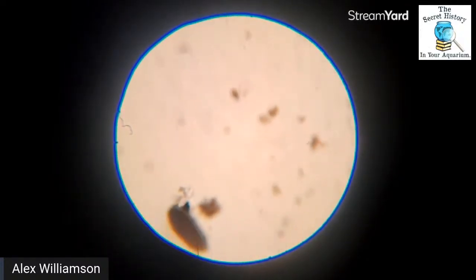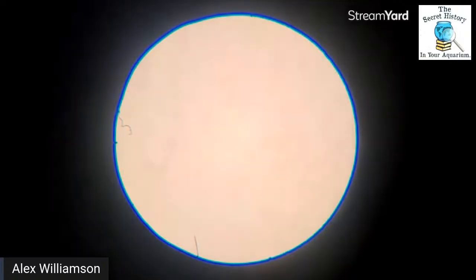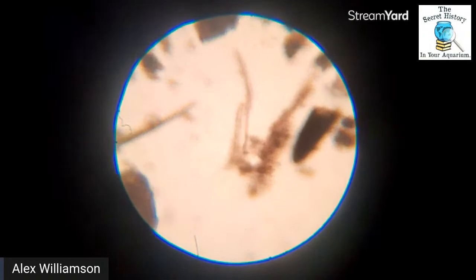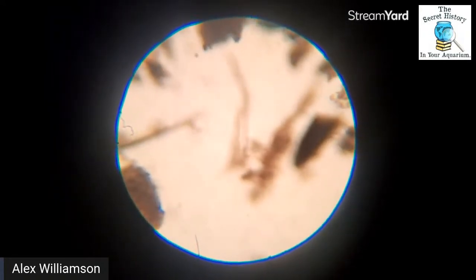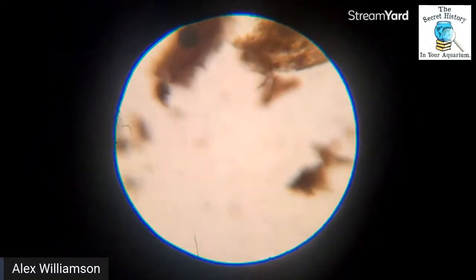So we're going to keep cruising here. What do we have here? So we have more mulm. In a planted tank, you have really quite a stable system. Honestly, it's a very healthy system. If we were not in StreamYard, I could zoom in on my phone too, which would give us at least another 50% zoom. Now there's some black hair algae as we go deeper into the puddle. We'll see some more life forms, and I'll stop moving. That's just the vibrations from my voice and my hand turning the knob. It's very sensitive when you get a little drop, obviously.